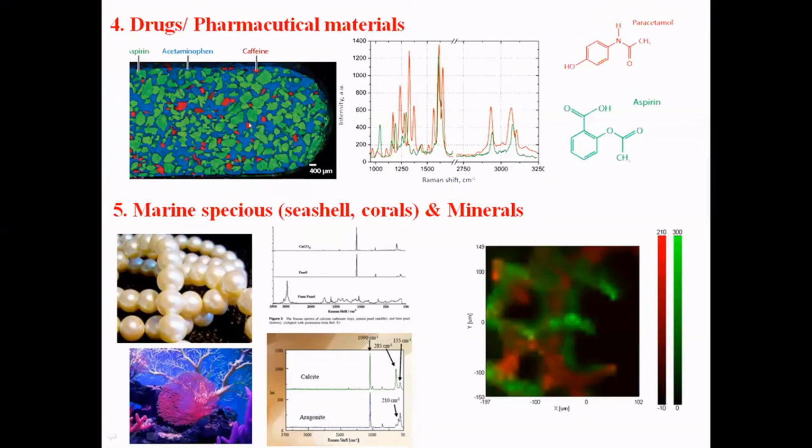So you see three different components, like aspirin, paracetamol, and other components that are surface coated. So you see the distribution. So one can exactly recalculate, or they can check whether their formulation is exactly present in the tablet or not. So as I said, the paracetamol should be distributed in that pattern, which is confirmed here. So all the surfaces are scanned with respect to the spectrum.